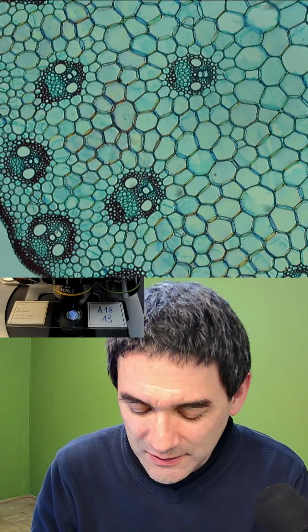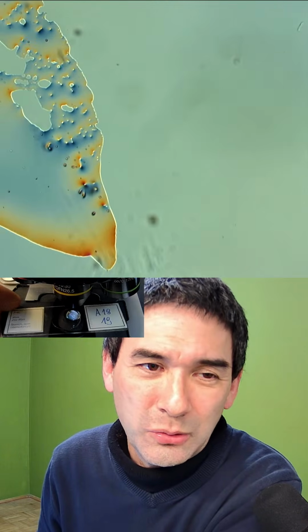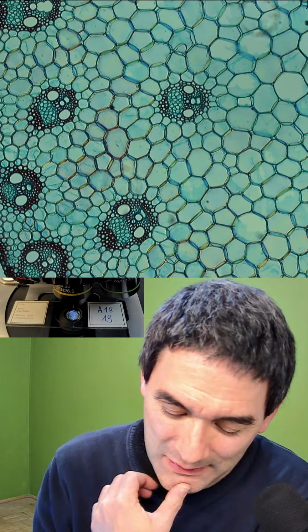Of course, there's always a little bit of biology involved, and sometimes it's nice to know and understand a little bit of what you see. But sometimes it's simply just cool to look at. I'm a teacher, and students like to ask questions, and very often the questions are, why are they arranged like that? What's the purpose or what's the meaning? Why does it look like that? There's got to be a reason behind it. And I've got to be honest with you, I don't know. Sometimes there is no reason. It's good enough. It works. The plant is able to survive.